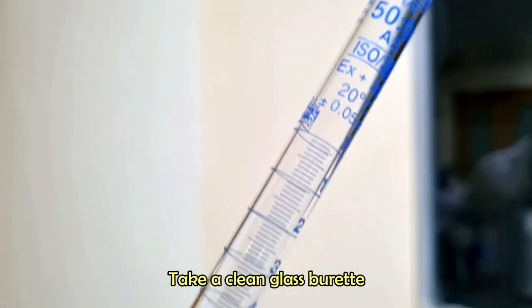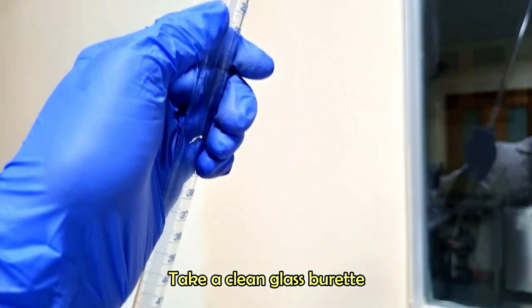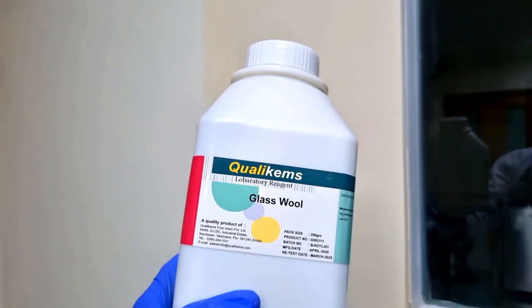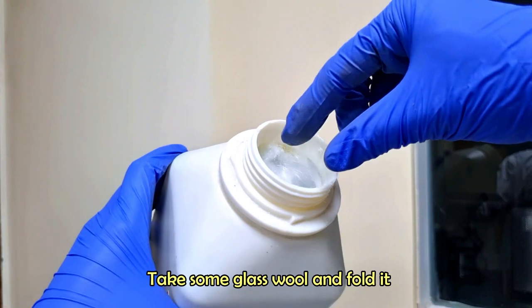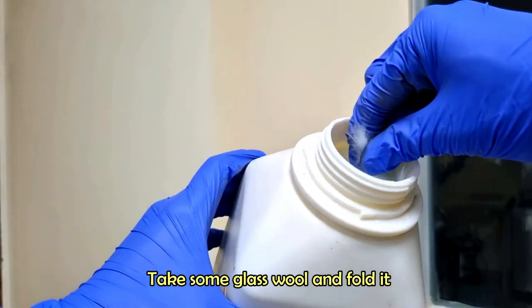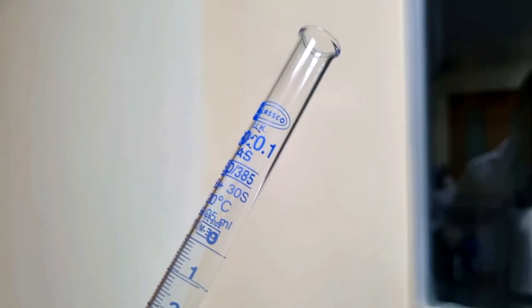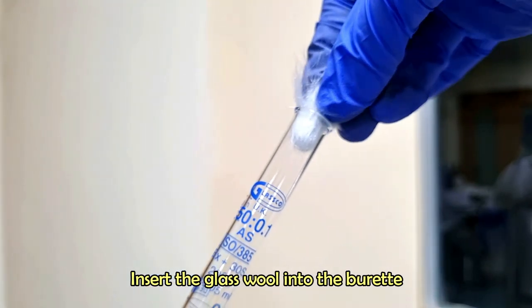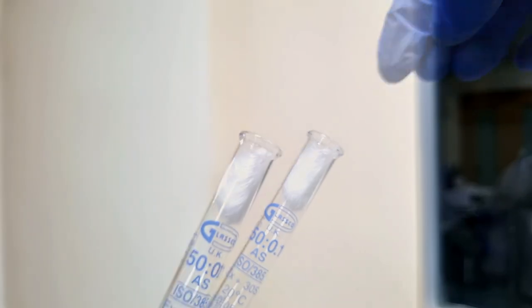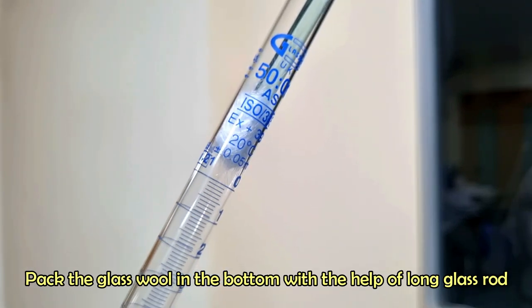Take a clean glass burette. Take some glass wool and fold it. Insert the glass wool and pack it in the bottom of the burette with the help of a long glass rod.